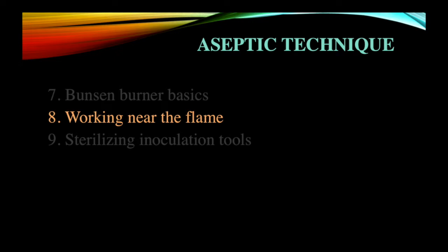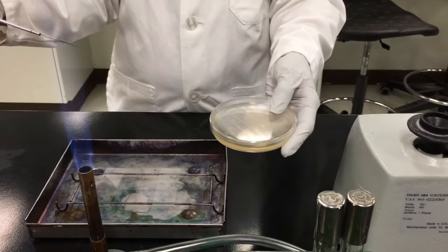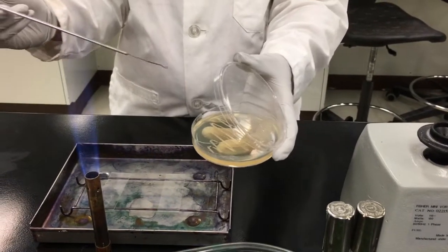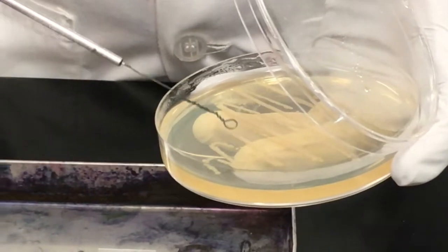Working near the flame is key to having aseptic technique. The zone of sterility created by the Bunsen burner flame is not a very large area and is only maintained by having this steady flame. Work slowly and meticulously and only open sterile items within this zone for a limited amount of time and only when they are immediately needed.